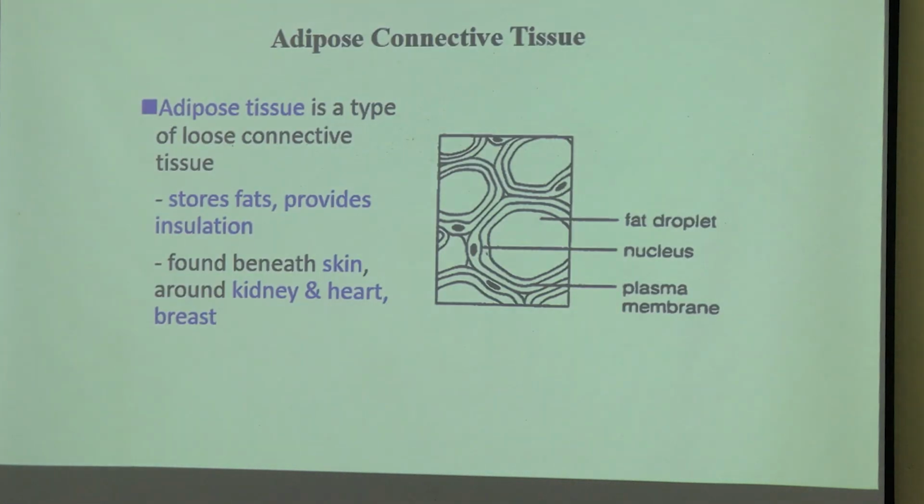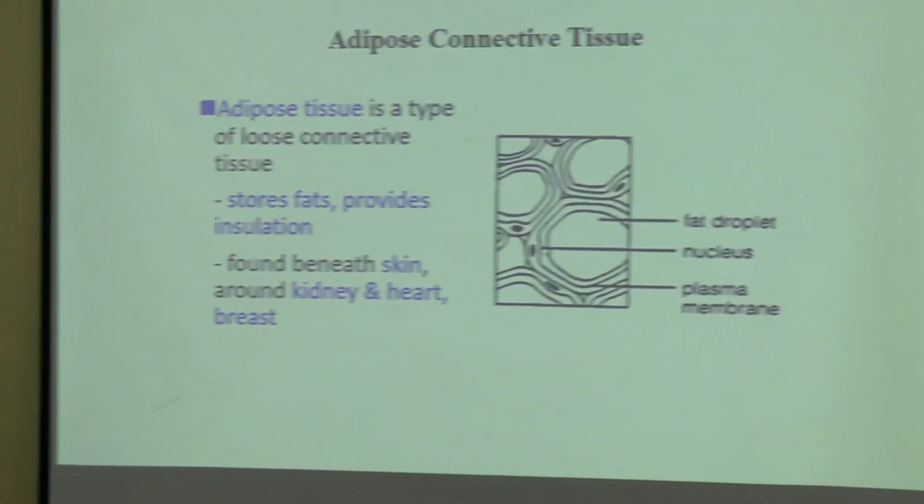Okay, next adipose tissue. The adipose tissue we have already discussed, right? You know adipocytes are there. They store fat, and the fat droplet is present inside them. The cells have a ring-like, signet ring appearance. Now where are they present? They are present under the skin, and behind the kidney.